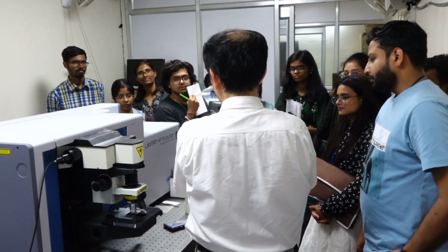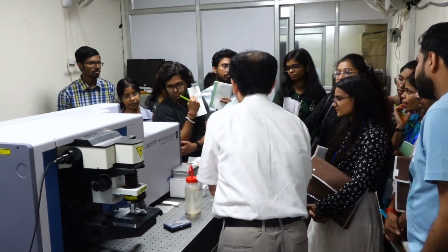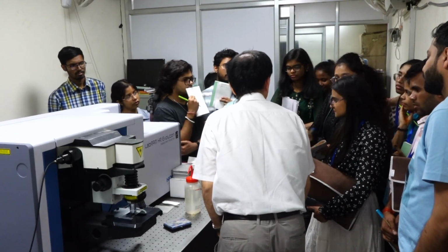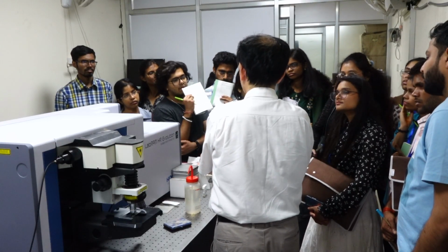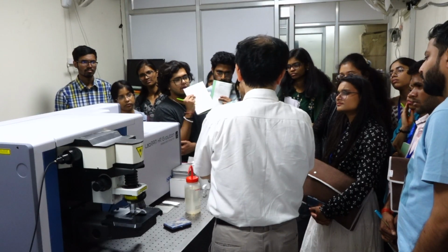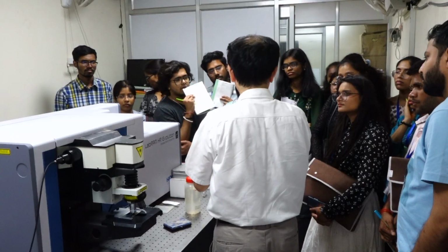Any other question? One more question. You explained that we are using a CCD detector. Apart from this CCD, we can use other types of detector. What is the advantage of using CCD in this particular case? So CCD is the first choice in this kind of instrument.